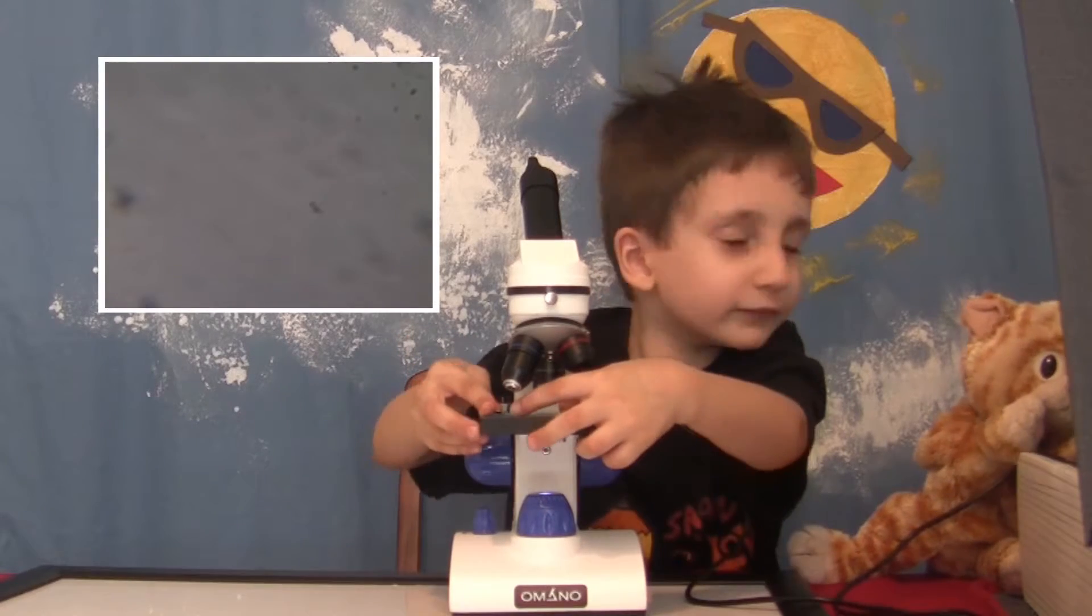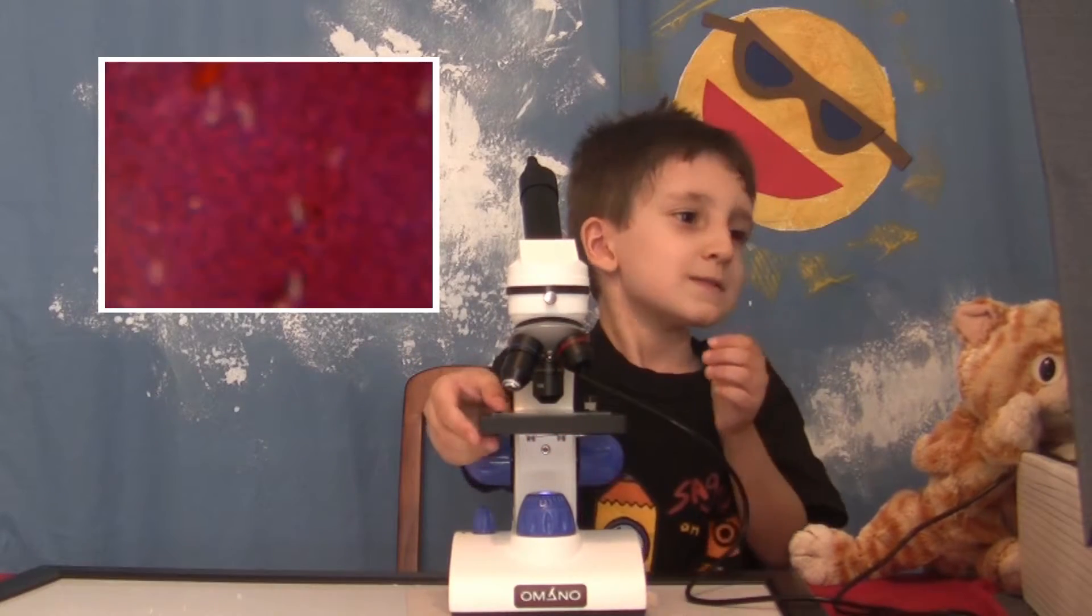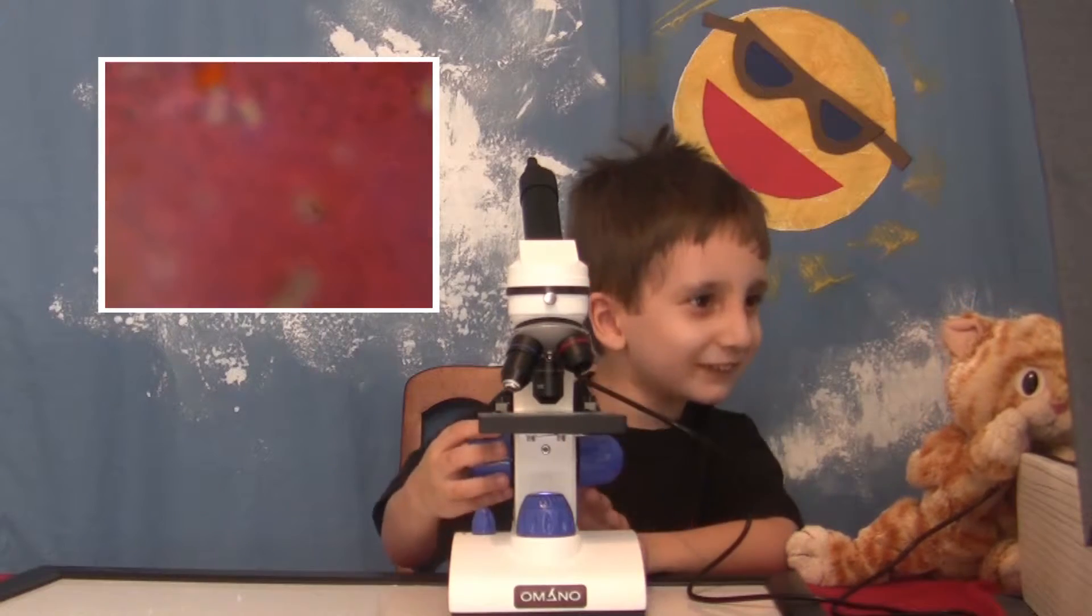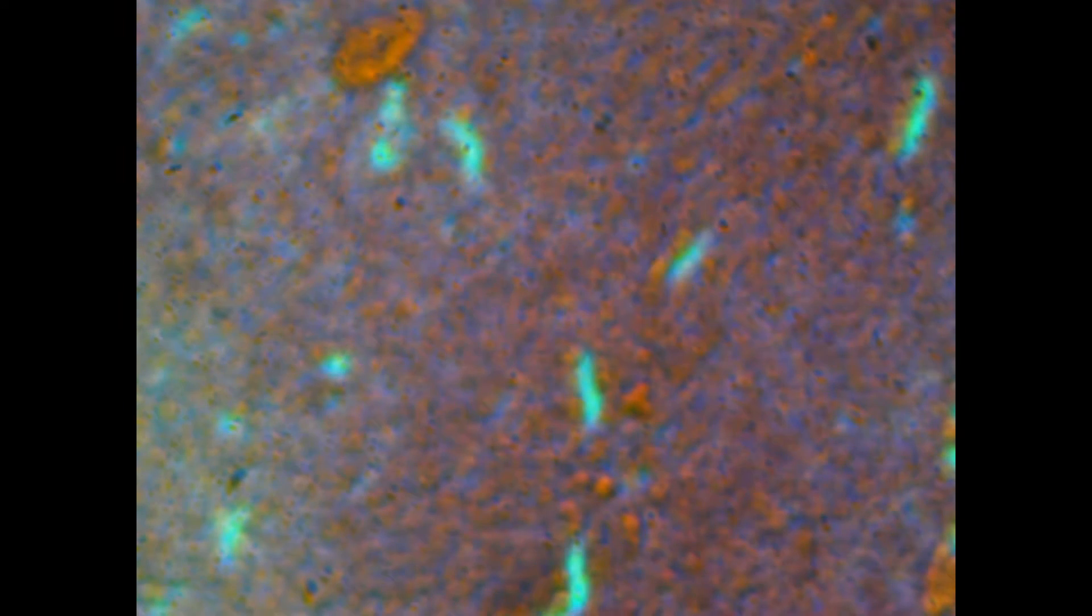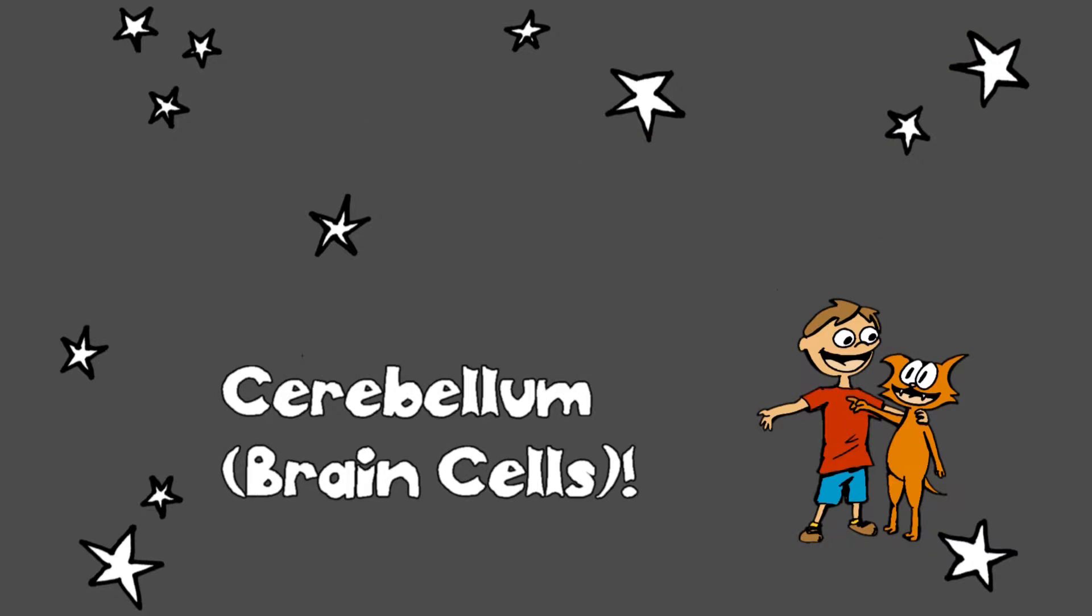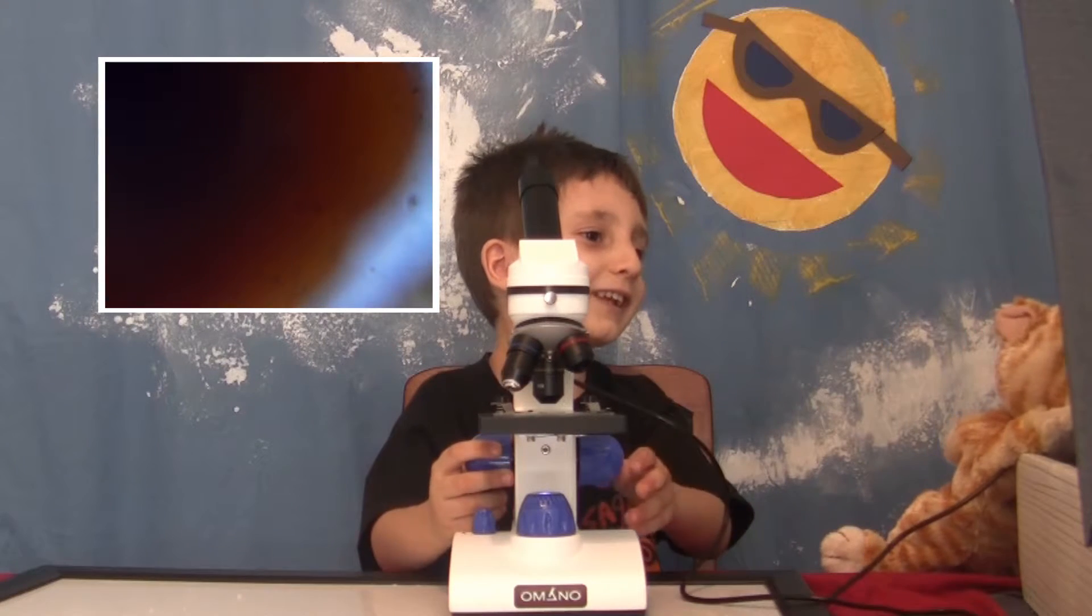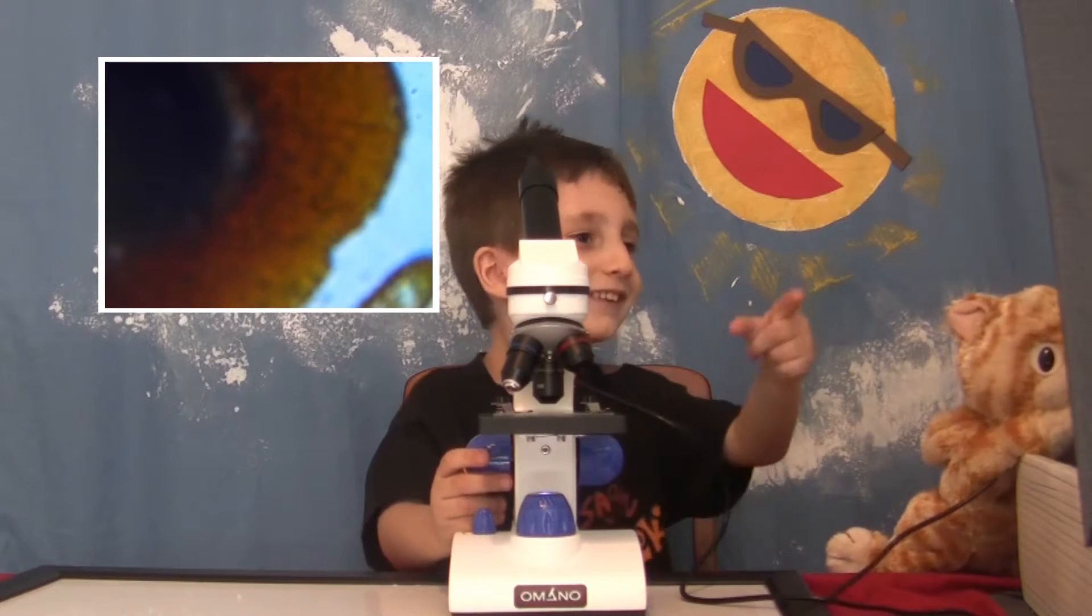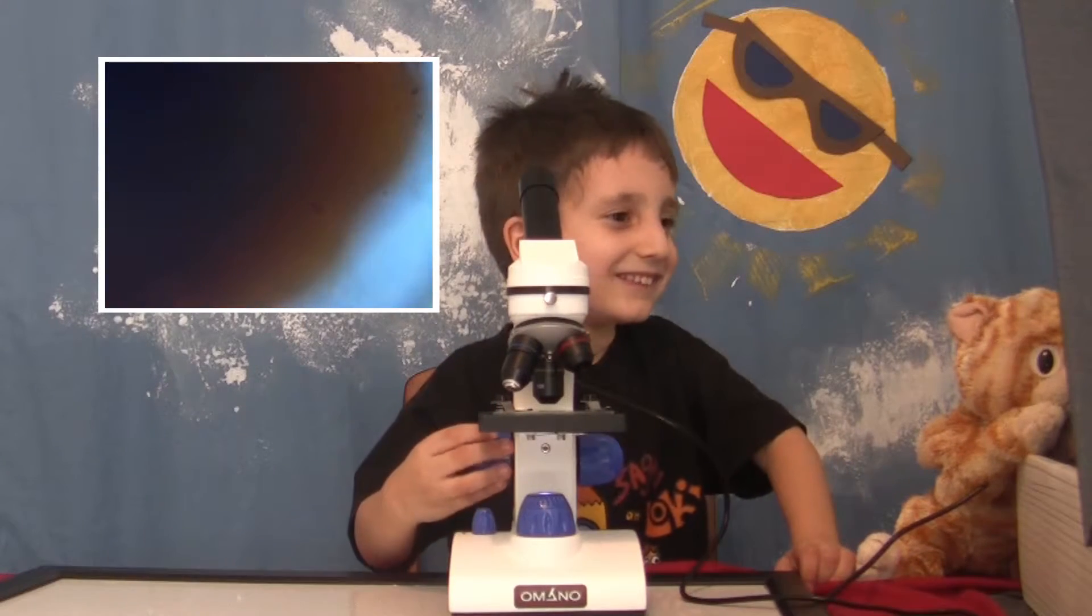Oh! I saw something! Wait! Wait! Wait! There it is! Wow! It's pretty red. I guess that makes sense. Wait! No! No! No! Let's see if it self-focuses. Oh! Wait! Wait! I saw it. Look! There it is. Whoa! Oh! Wait! You see? Look! It looks like a chip! A chip!